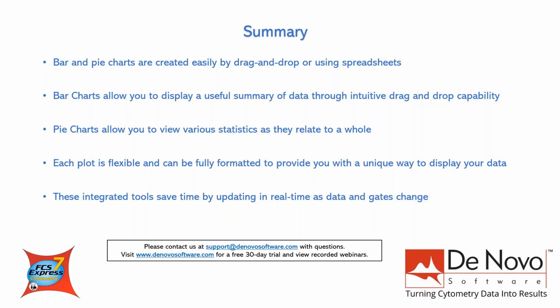These tools are integrated to save you time by having all of the plots and spreadsheets and charts and everything else linked together so that they can update in real time as your data and gates change, so that you can see your results as you move around your analysis.